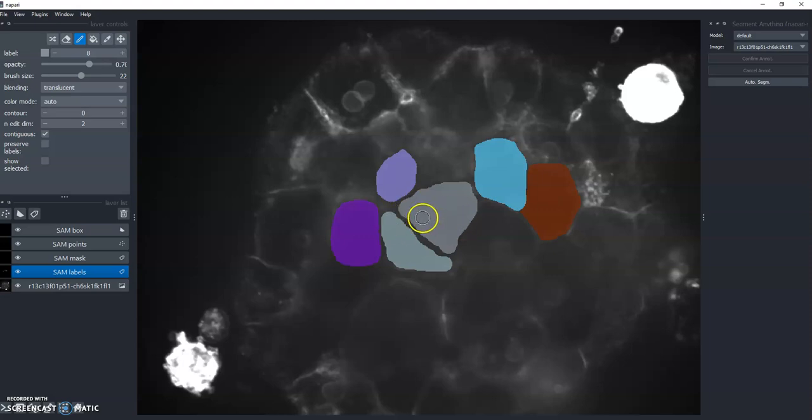It just learns the general trends. Of course, that's as long as you have enough training data. If you just used one image, no augmentation, then it would learn your imperfections. But if you have lots of labels, some imperfections aren't going to destroy your machine learning system.